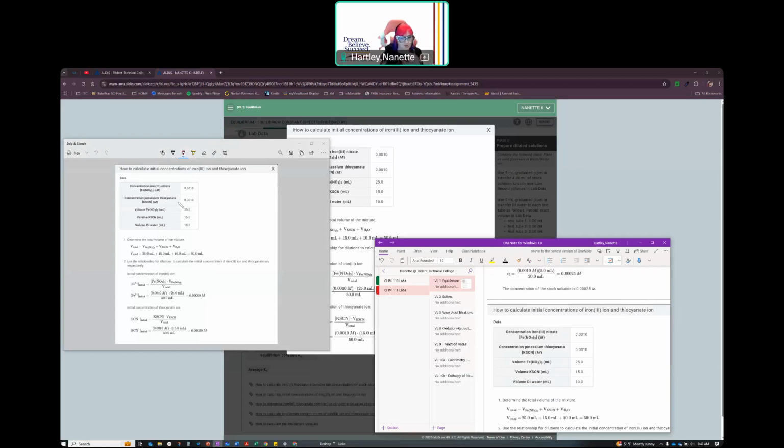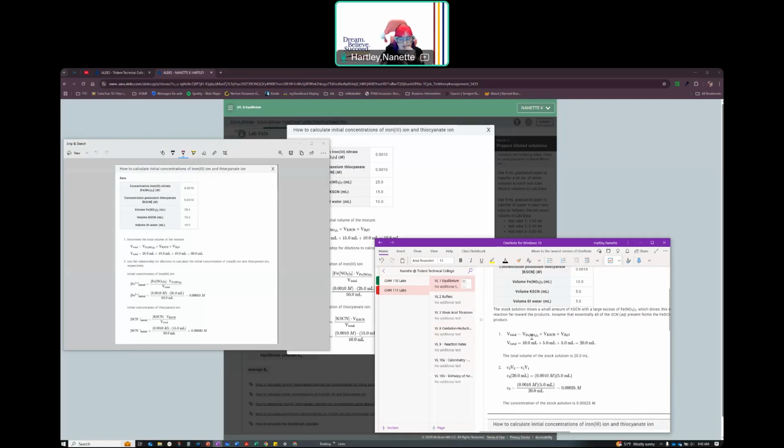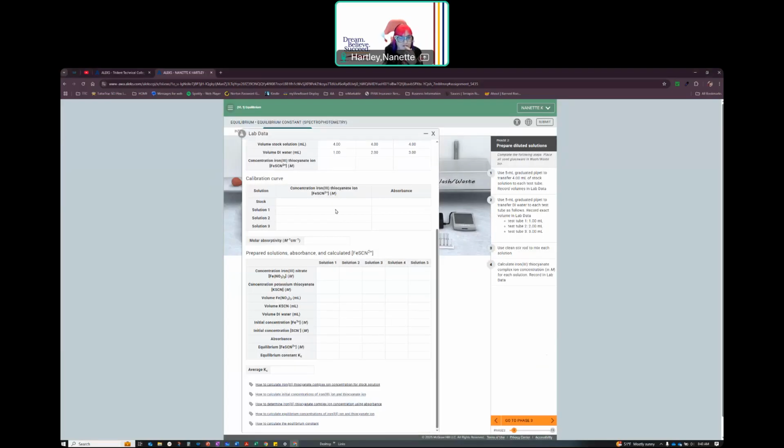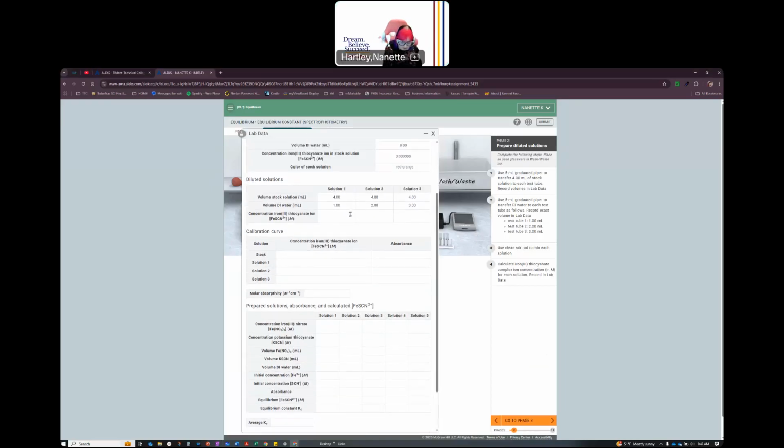So I don't think this is going to apply yet. But this, we've just added water to it. So I've got a concentration initially, and I've added, we've got a different volume. This probably still applies. So let's use that. So I'm going to close that. Say, okay. So I use the diluted SCN solution. I'm going to pull up this.